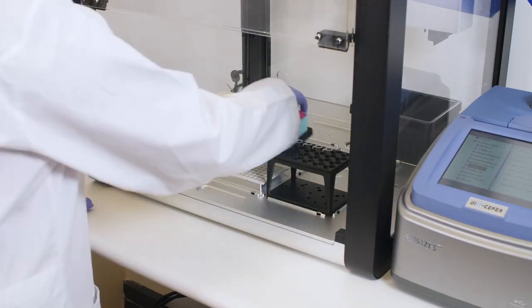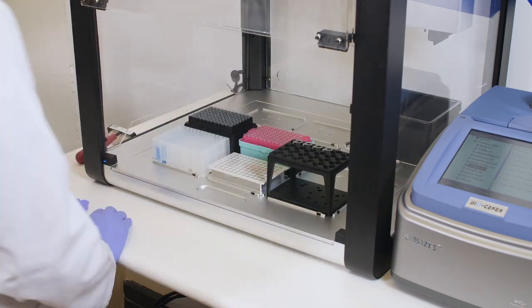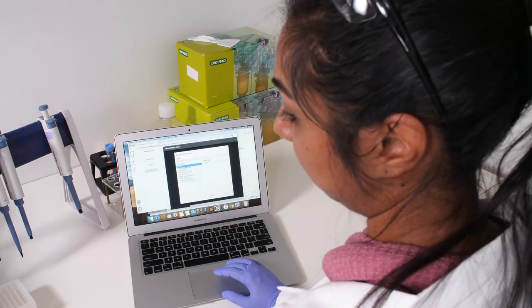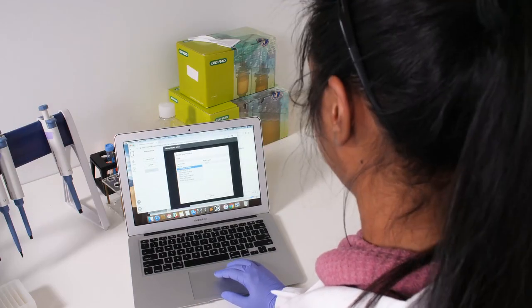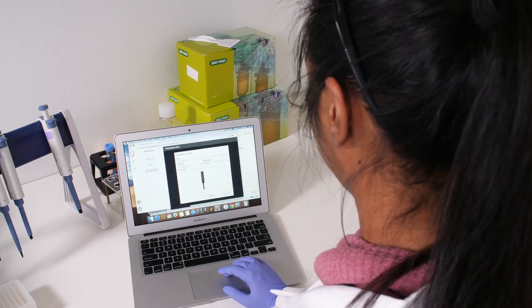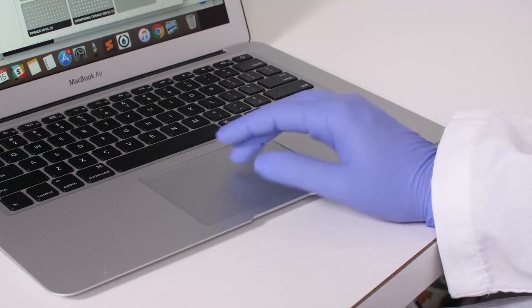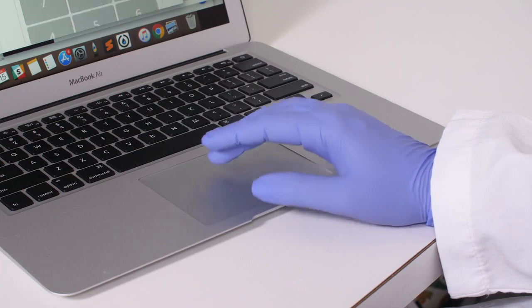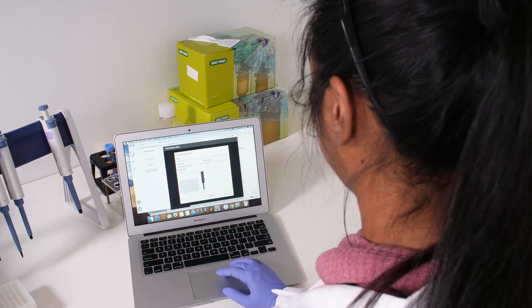Third, place your samples and reagents on the deck of the OT2 and go through this simple calibration process in the OpenTron's Run app. Then, hit Run.